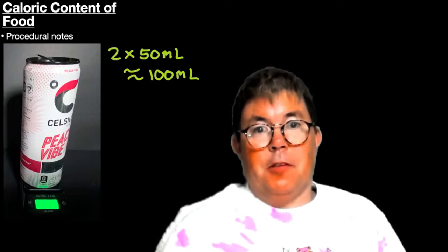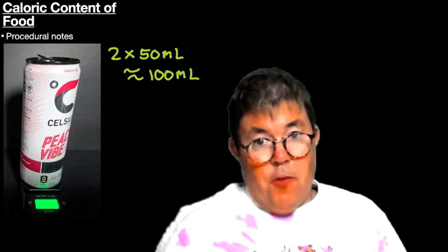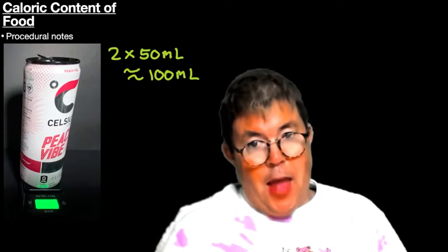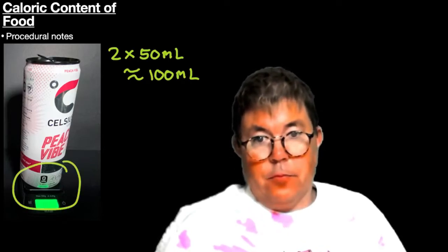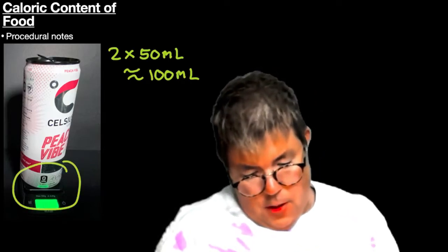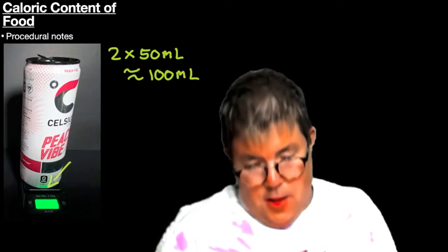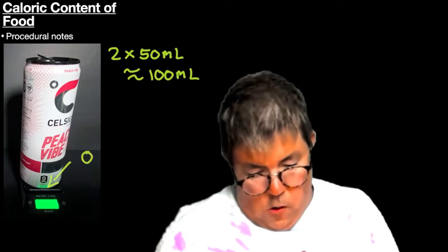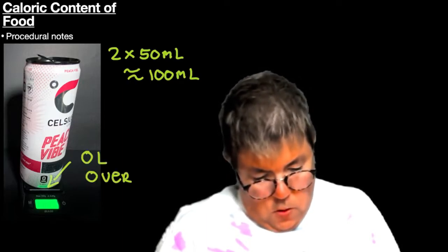This happens to be Celsius can on the left side. If we look carefully at the balance, we'll see something. What do we notice? It should say OL, or overload.